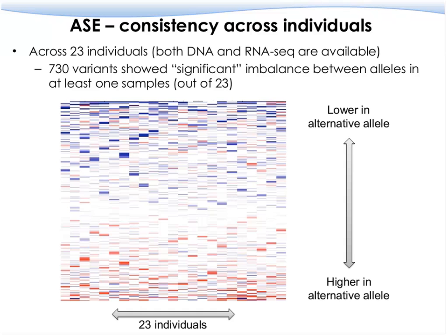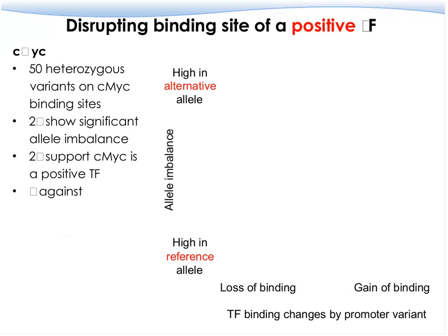As you can see, although there is a lot of variability among individuals, there is a general trend that this allele-specific expression can be replicated across multiple individuals.